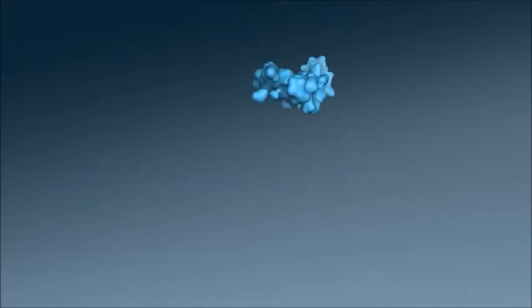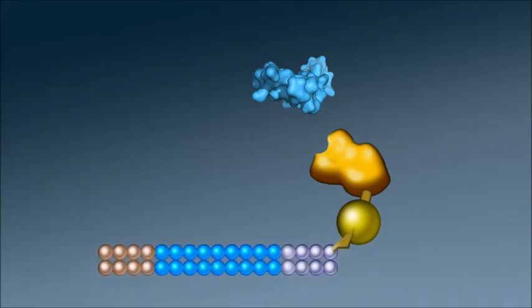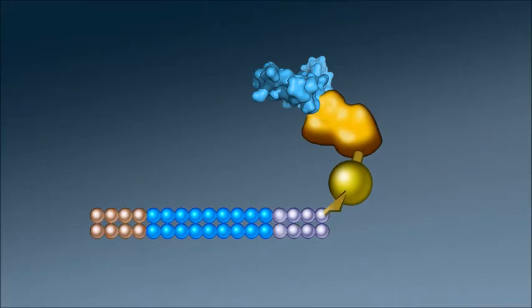Ribosome display is limited to proteins labeled with DNAs, so it can be very useful for protein engineering. For unlabeled proteins from biological samples, we need an alternative method for the barcoding. We can indirectly barcode proteins by using barcoded binders that recognize proteins of interest. For example, we are using nanobodies, which are small antibodies that contain a specific region that binds to a protein of interest. The nanobody can be coupled to a barcoding DNA via an enzyme tag.